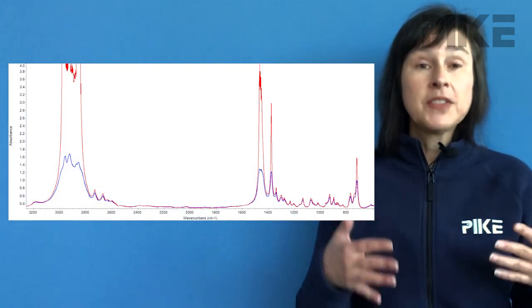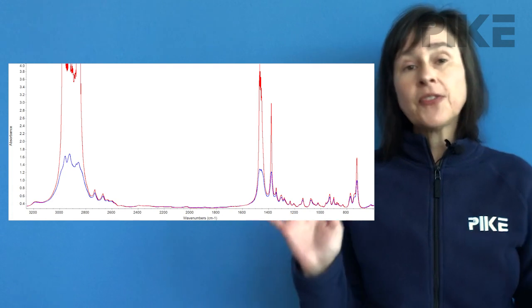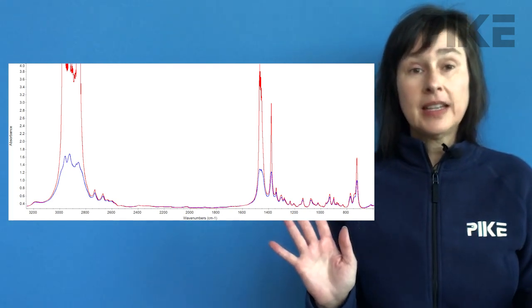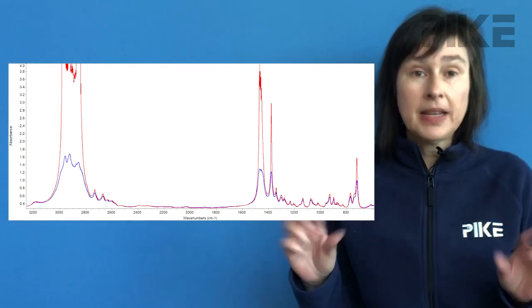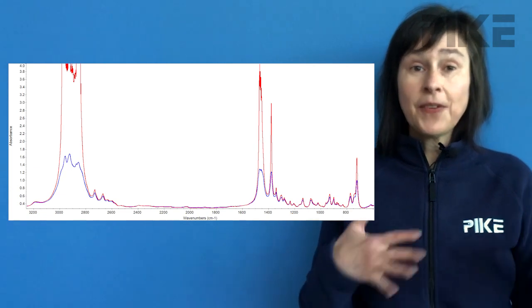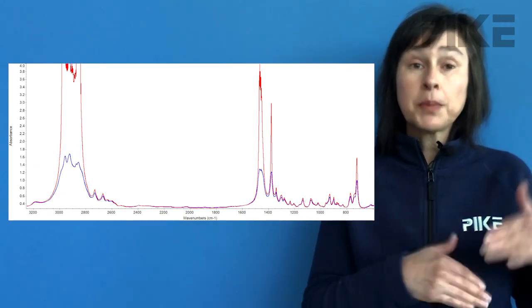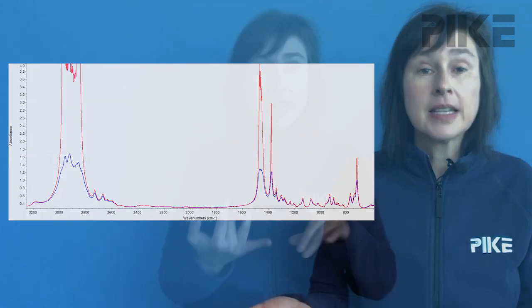So what do we notice about this spectrum? We notice we have some really strong bands saturating. That's fine if what we're interested in are the less absorbing bands. But we also notice there's a difference between these two spectra in terms of absorbance band magnitude. So what caused this?